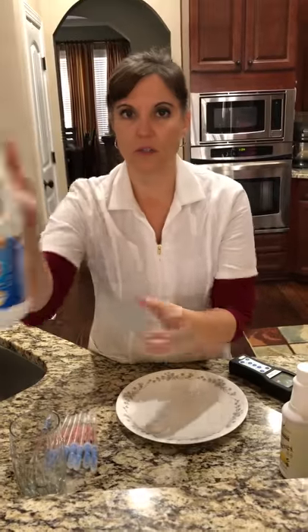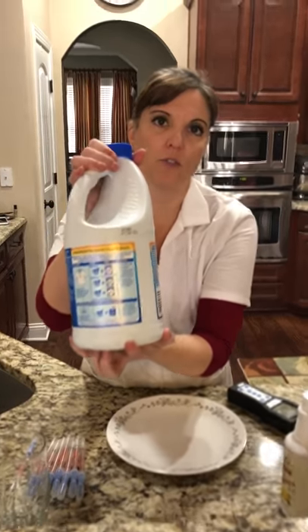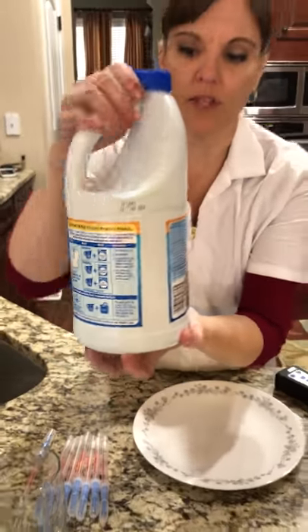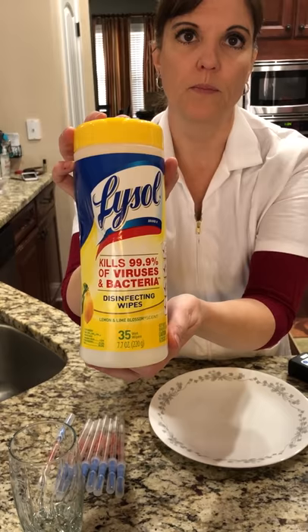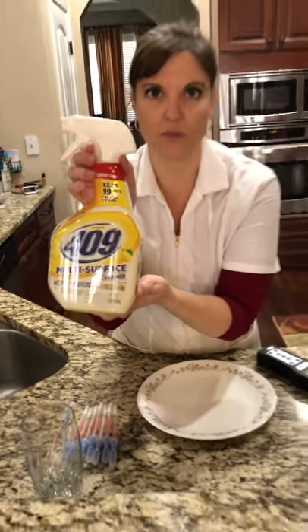And then we're going to do Klox bleach at the recommended dilution ratio, which is a half a cup per gallon — that is at 3% dilution ratio. We're going to do Lysol wipes, and then we will do 409, since many people use 409 for their counters.